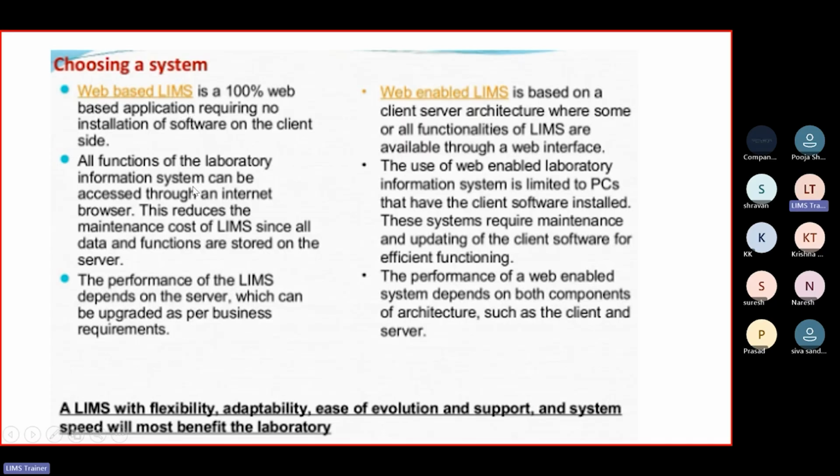All functions of the laboratory information system can be accessed through the internet browser. This reduces the maintenance cost of LIMS, since all the data and functions are stored on the server. Labware also provides limited access on tablets and mobile applications as well.